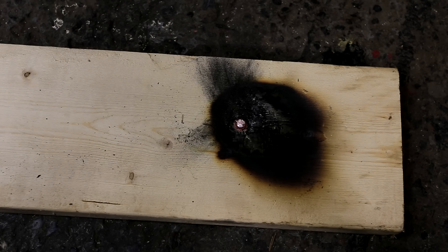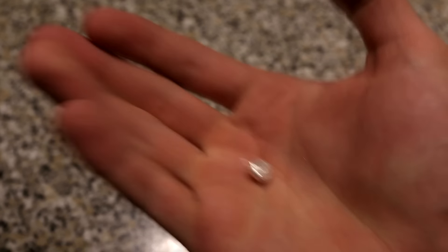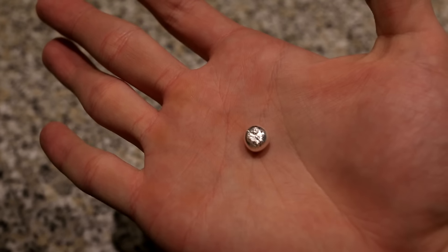If you leave it in the crucible and let it cool down, it will stick to the crucible and be nearly impossible to remove unless you shatter the crucible. This is what the final extracted silver looks like. Note that this silver extraction is not quantitative, and silver will be lost in the process.